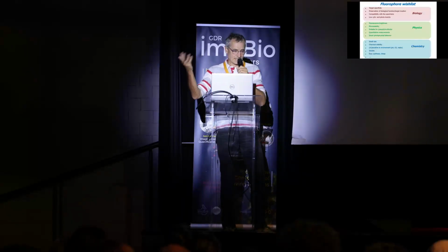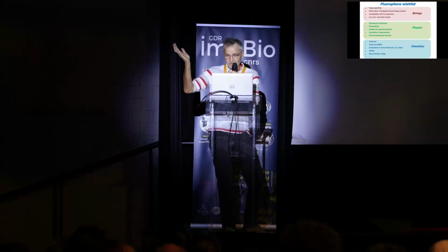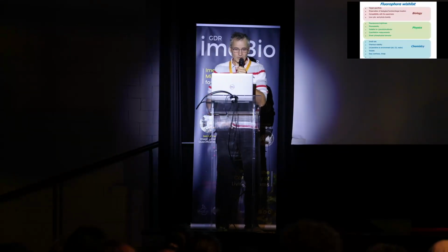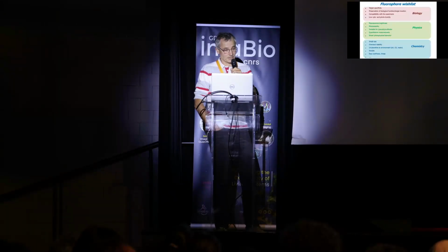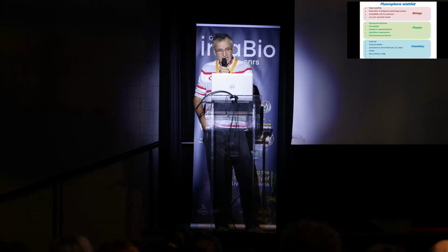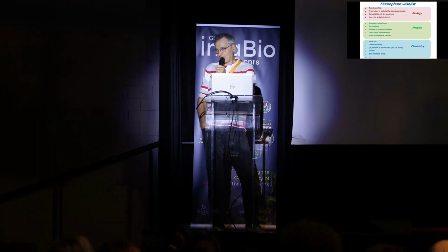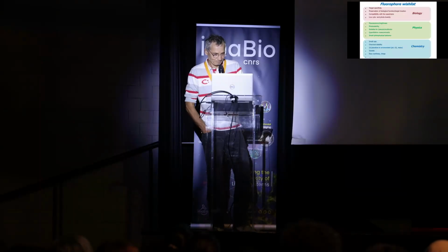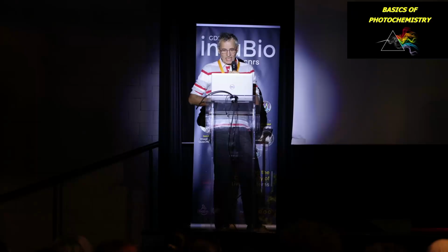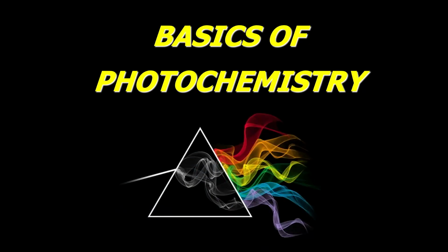That's more like a sensing fluorophore for pH, oxygen, redox, or whatever analyte. Organic fluorophores should be soluble, and for the chemist, hopefully easy to synthesize, and for the users, cheap to buy.